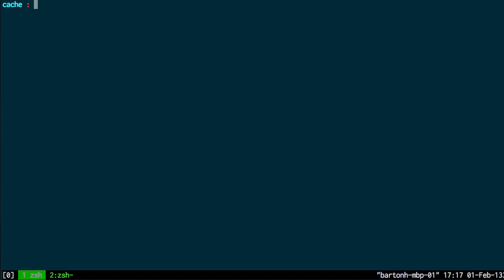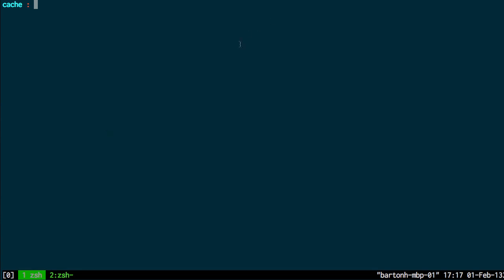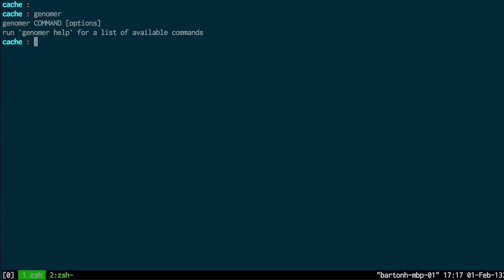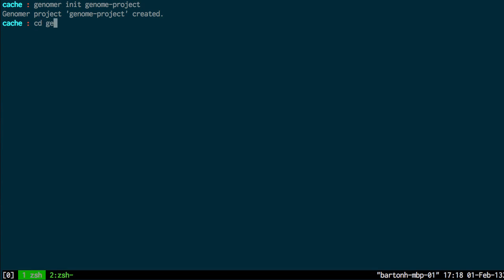I assume that you already have Genomer installed to follow this screencast. You can just test that by typing Genomer in. I'm going to start off by creating an example Genomer project. That's using the init command and that's created a project so I'll cd to that project.